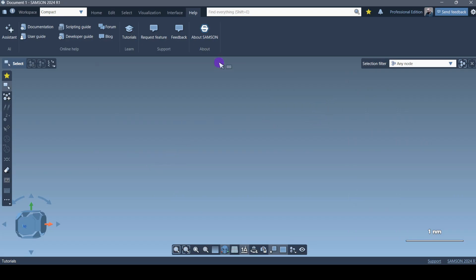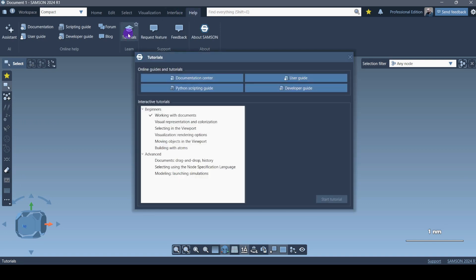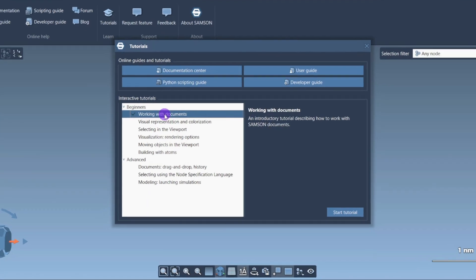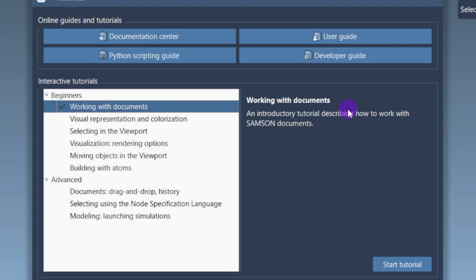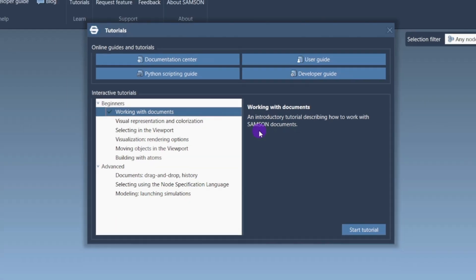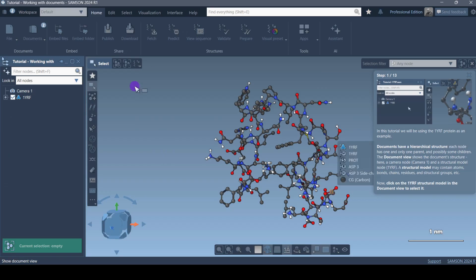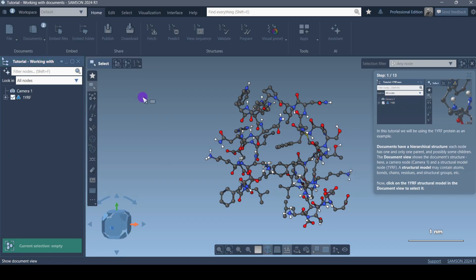When I clicked on that, the help section closed, so I have to click on Tutorials again and then click on 'Working with Documents.' When you click on 'Working with Documents' it tells you this is an introductory tutorial describing how to work with SAMSON documents. When you create or start a project it will be a SAMSON document — that is my understanding. Now click on 'Start Tutorial.'